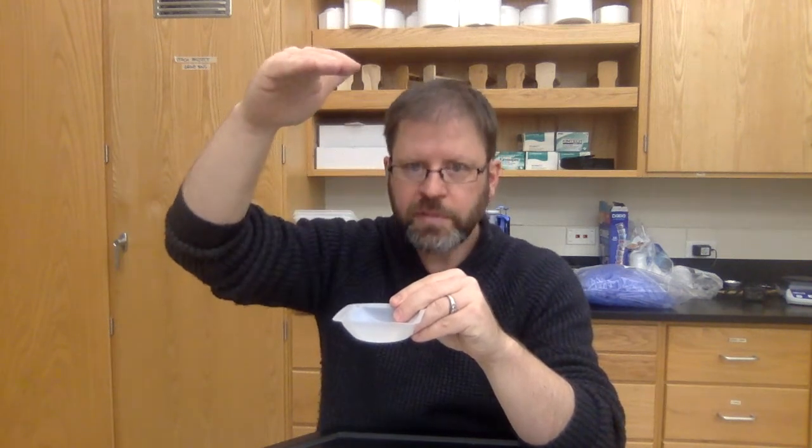So there's 1 gram of vitamin C per however many grams of tablet. Then you're going to take a mortar and pestle, and you're going to grind it up, and you're going to assume that this is uniformly mixed in here, and so that it holds that same proportion. And you're going to be able to take a sample of that powder and dissolve it into a known quantity of water.